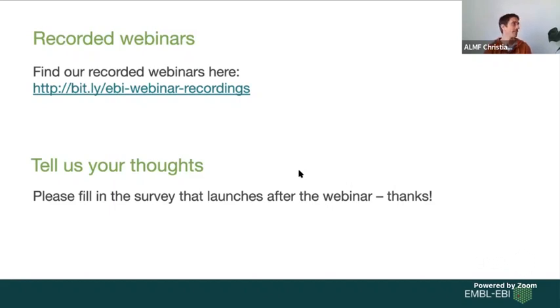So generally, the thing to do is this label mask image concept. You have to somehow create a second image that's a label mask, which I explained in the talk, and then like MorphoLibJ or 3D image suite if you use Fiji, or also scikit-image in Python. This is really the standard way.